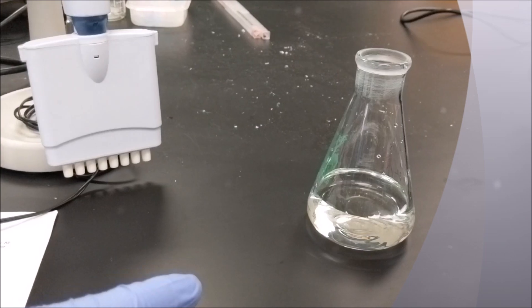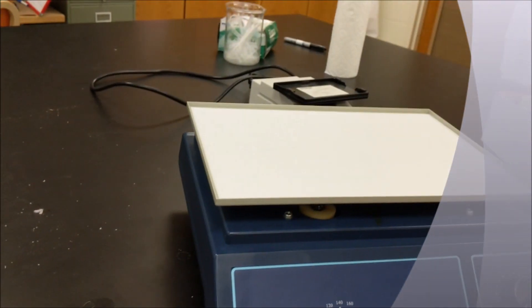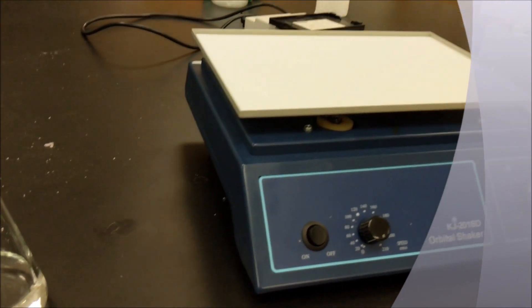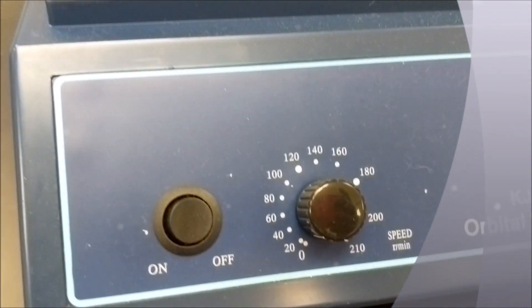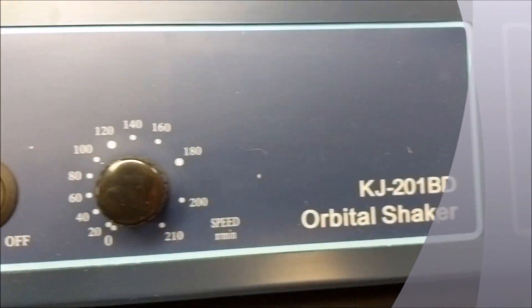If you want to mix a liquid solution using an orbital shaker, you must begin by ensuring that the orbital shaker is turned off and that all knobs are in their lowest positions.